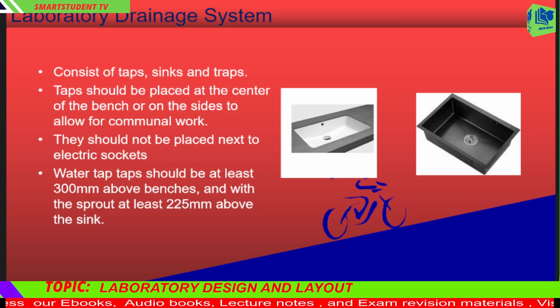Sinks should also be provided for washing and rinsing various laboratory wares. One water tap and a sink is recommended per 6 pupils spaced around the lab, and each should be large enough for experimental equipment. Another sink and water tap should be included in the fume cupboard. Sinks can be made of plastic, stainless steel, ceramics, etc.